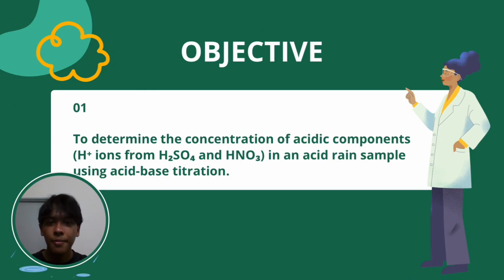Hi, my name is Muhammad Ikan Fitri bin Muhammad Faizal, and we will discuss how to better understand the relationship between acid rain and volumetric analysis. We will run through an experiment to determine the concentration of acidic components in an acid rain sample using acid-base titration.